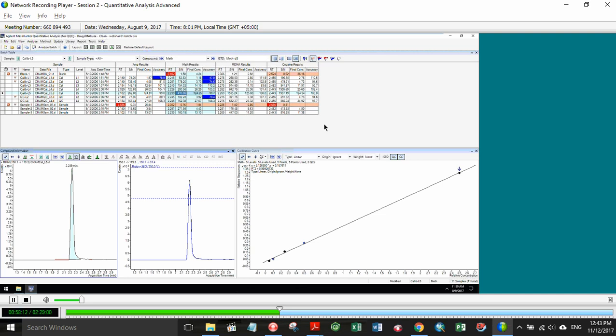Yeah, and I think that's linked to the other question about, can we show when we turn off one of those points. It would certainly be available in a report if you're including the calibration curve in the report. But there could be an advantage to having it just in that Excel export table, because that's a nice, quick, easy thing to get. But yeah, we can definitely dig into that and see what we can find.